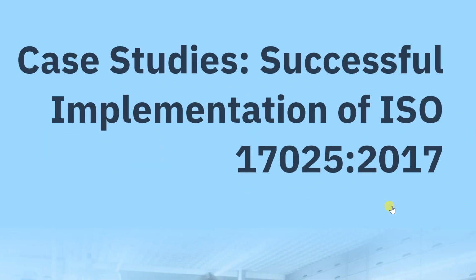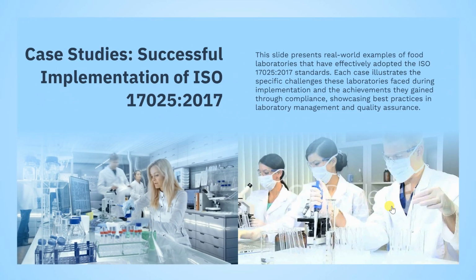Now, some of the case studies of successful implementation of this ISO 17025, what could they be? Look at the order, the organization, the neatness, the arrangement of each and everything. Look at the morale, the focus these people have toward their work. No distraction at all. But coming to Africa, you might have some people who are eating in the labs. They do not hang their SOPs on the wall or over the equipment that they are using. So it is a pity that we continue in that way.